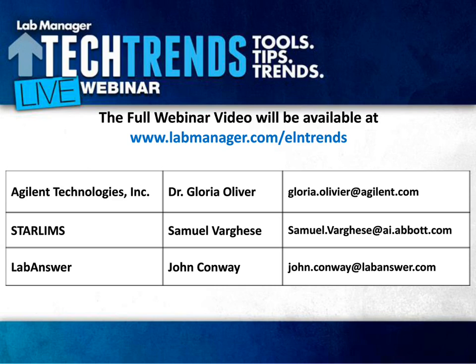Sure. So the way it works in OpenLAB ELN is you can generate a report off of any page in the notebook. This is typically done in PDF format because that's the most convenient document to pass and exchange with other people. But we also allow you to take reports off of your chromatography data system or whatever other software applications you already are using in the lab. You can easily import those reports into a page of your ELN. So it depends on what kind of report you're looking for, but it's just a click of a button within OpenLAB ELN to generate a report out of the software.